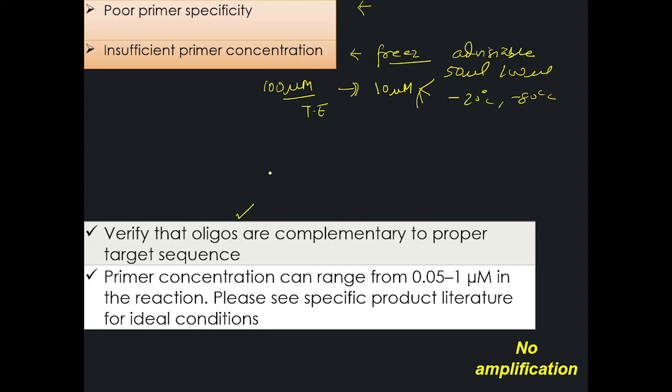You can use the NCBI software tools for this, putting your gene sequence in FASTA format, and then search whether your primers can bind with that or not, and you can use an optimal concentration of primers to solve that. You can also search for specific literature information if someone else has worked on it.